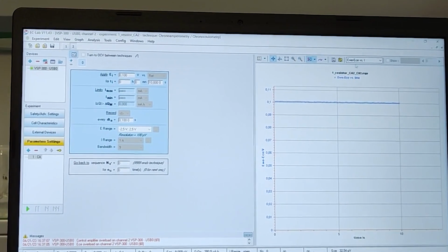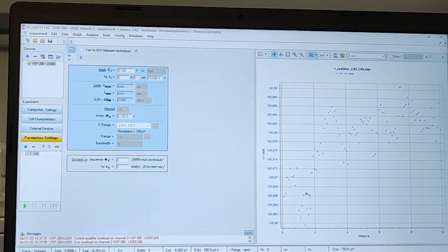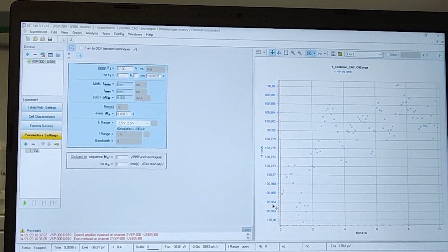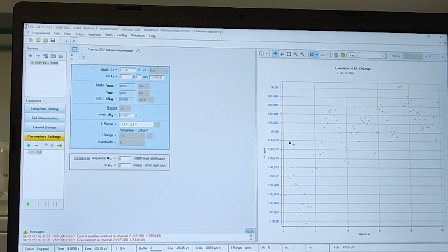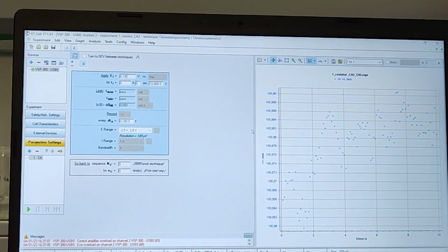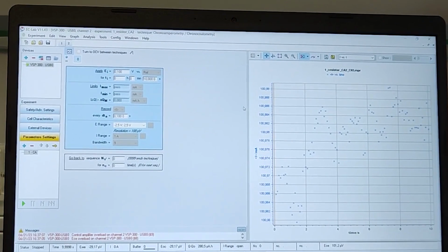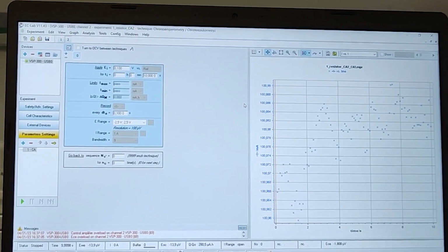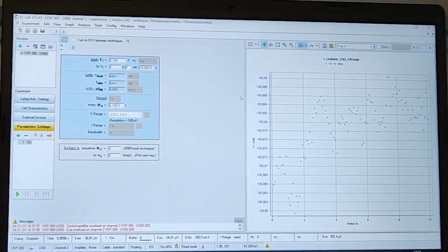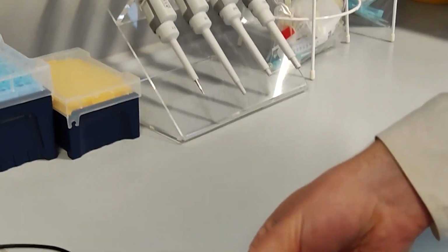Now, the experiment is complete. Let us look at what the current is like. You can see the current is pretty much exactly stable between 101 milliamps, actually 100.96 and 100.99. You can see slight deviations because in a real experiment the values are never quite precise and exact. But you can see the resistor is almost exactly 1 ohm. We have applied 100 millivolts and received a current of 100 milliamps. Easy enough. Let us now look at how the capacitor behaves.